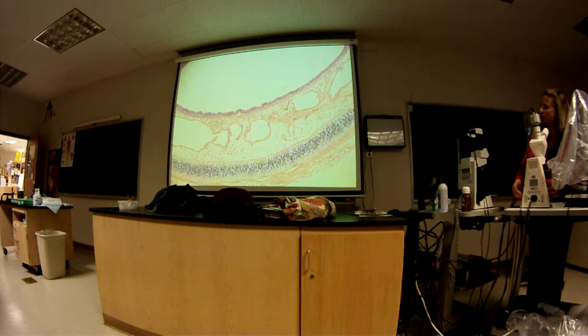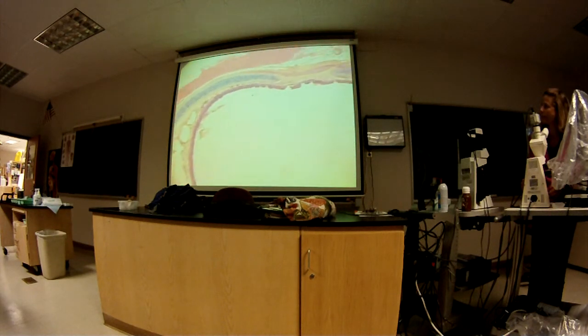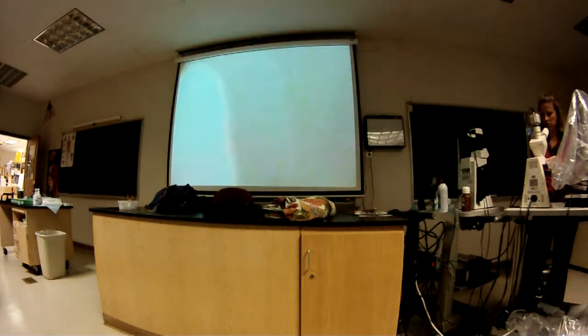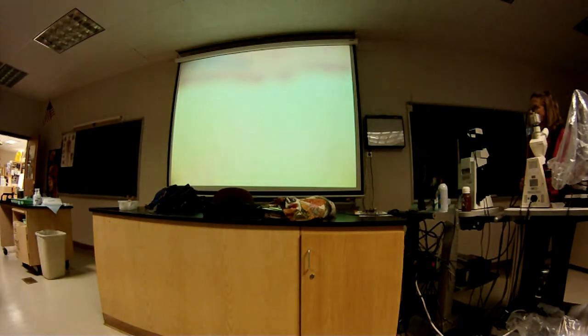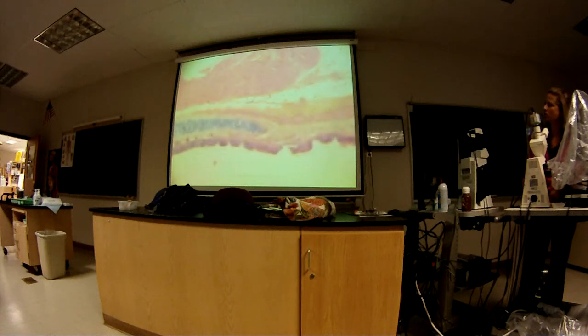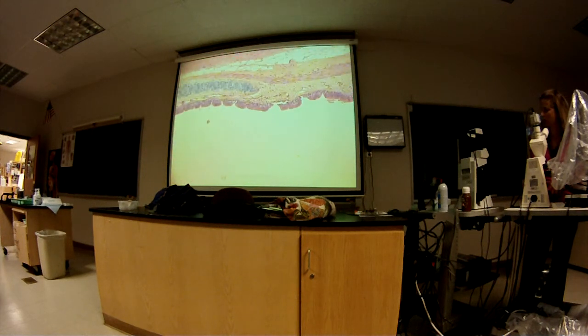Okay, so what organ, if I can get it in focus. Okay, take a look at that. Get a little closer now. What organ was the question? Okay, here's a little closer, so that's pretty good. Yeah, that's the trachea.